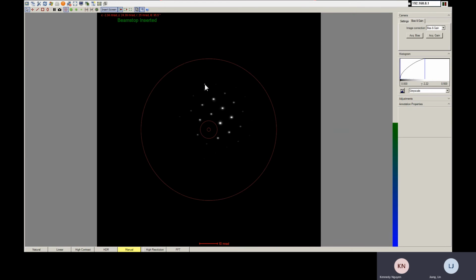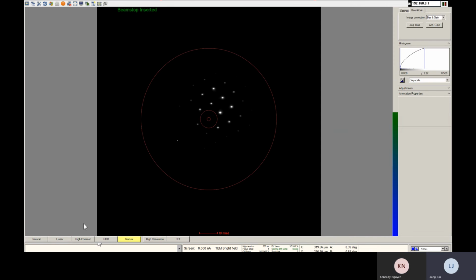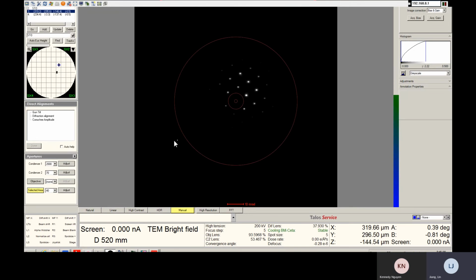Okay. We could switch back to Velox. Oh, you're using the full screen, right? Or what happened? Oh, okay. You can go there. Just switch back.